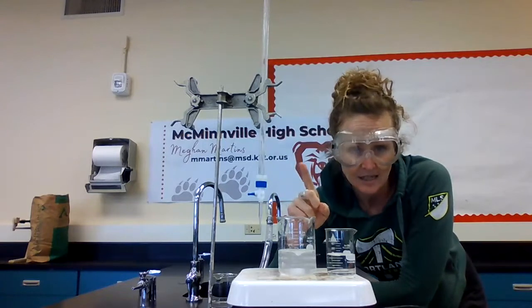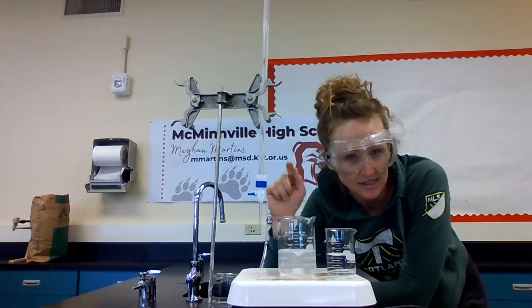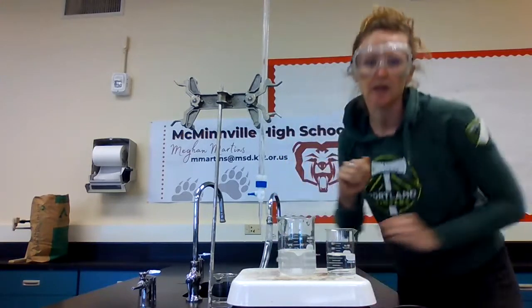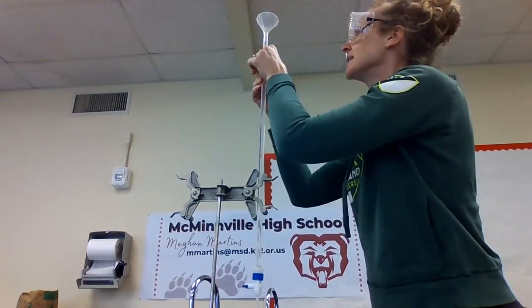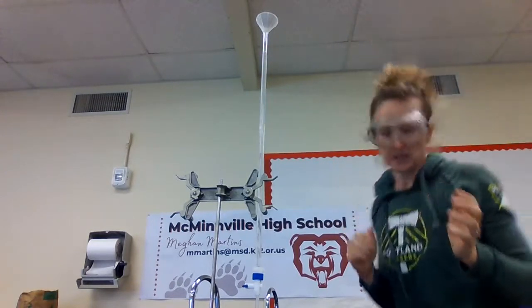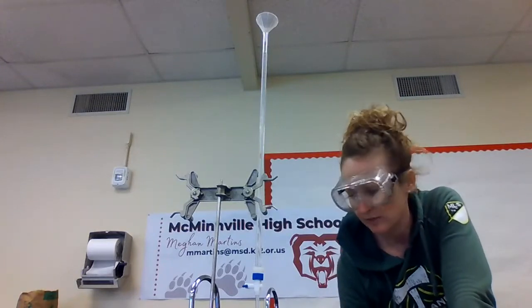You are probably figuring out the concentration of your unknown. Okay, next tip. Burettes are kind of difficult to read. So let's take a starting mark for our burette, and I'll show you what I'm talking about. Our burette right now is at 2.5 milliliters. So write that down. Our starting amount is 2.5 milliliters.